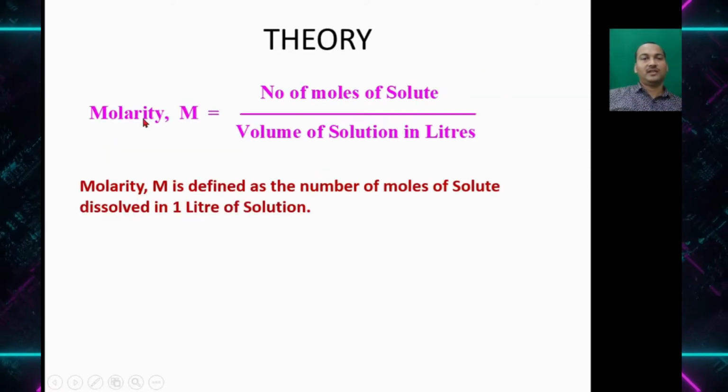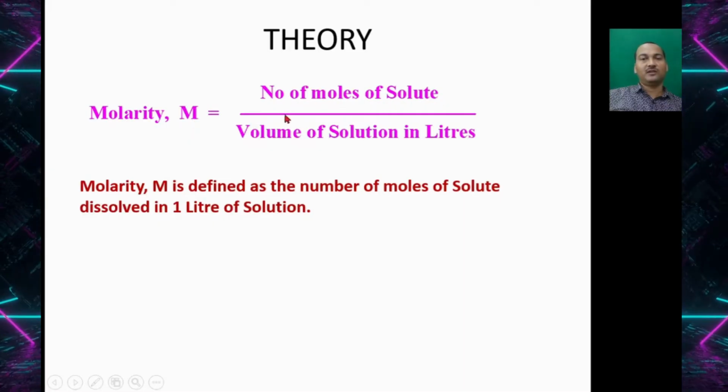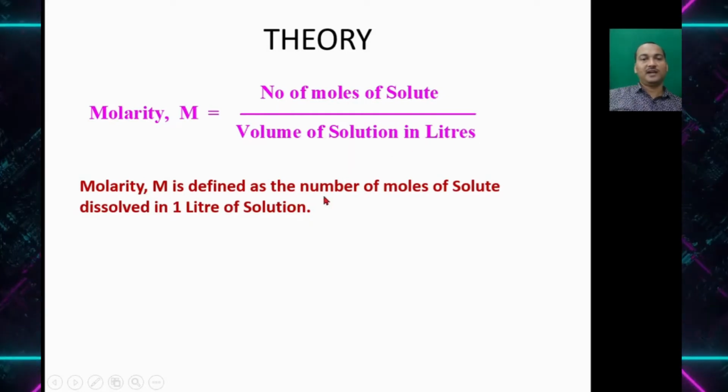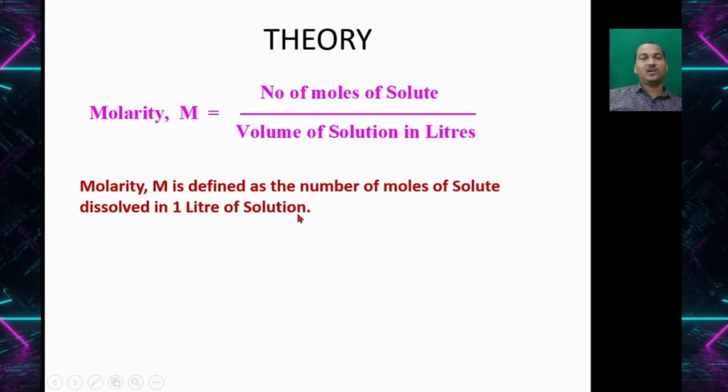So as we know, the theory is molarity, capital M, that is the number of moles of solute divided by the volume of solution in liter. So molarity, capital M, is defined as the number of moles of solute dissolved in 1 liter of solution.